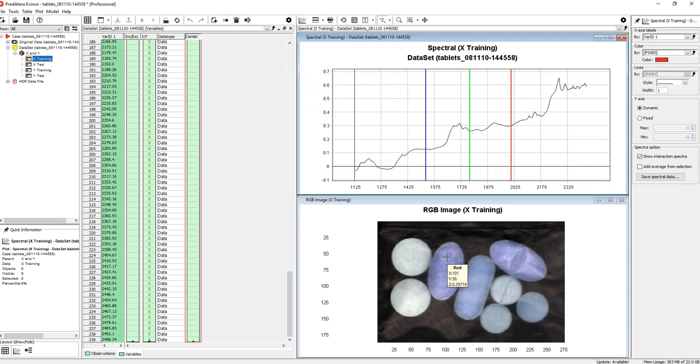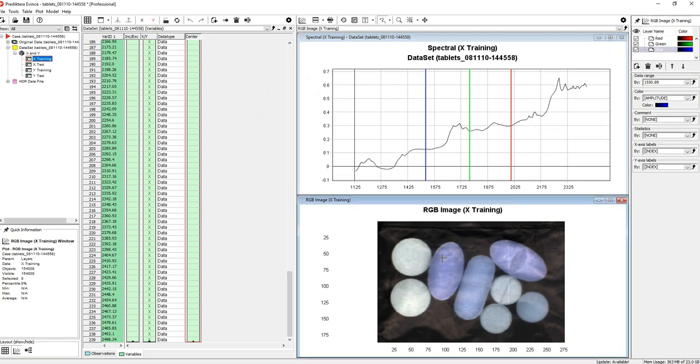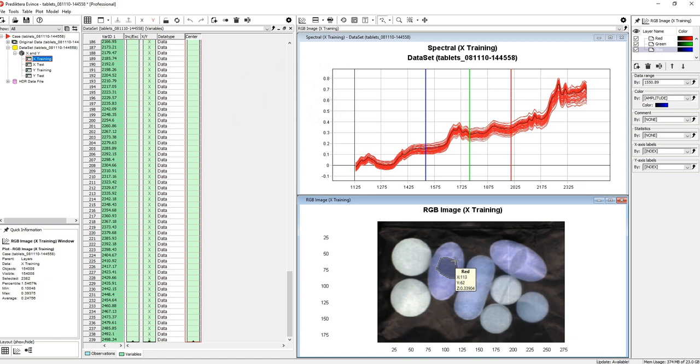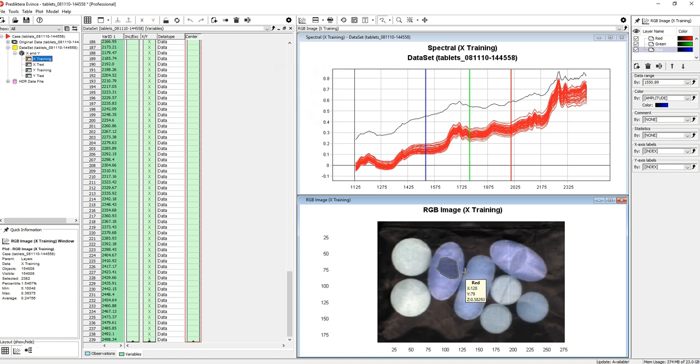By holding down the left mouse button and making a selection of several pixels, a representative sample of up to around 50 spectral profiles from this selection will be displayed in the spectral plot. By holding down the control key on your keyboard you can make several selections.